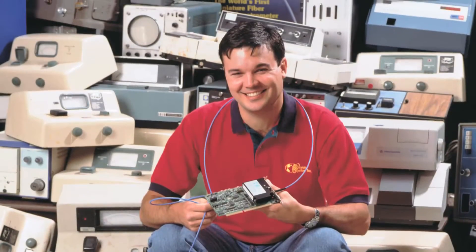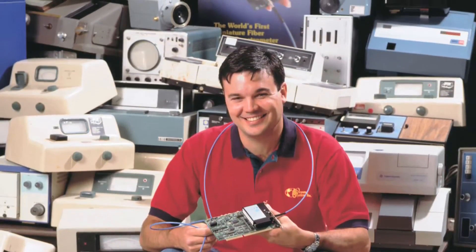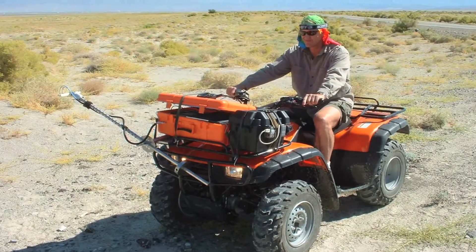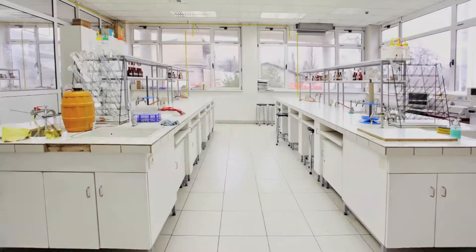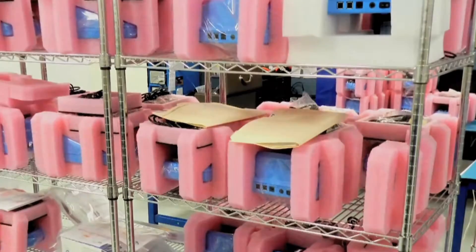It's not just about bulky, single-purpose instruments sitting on a lab bench. Spectroscopy can also be dynamic and portable, solving problems in the field. These are the same products that researchers and manufacturers use in their labs and in OEM product designs.